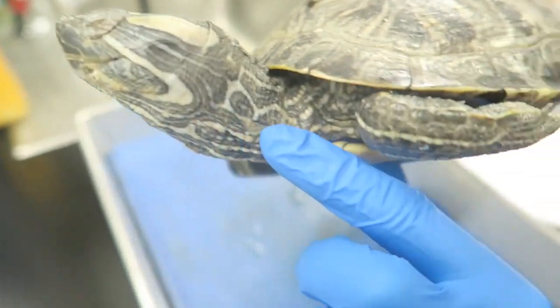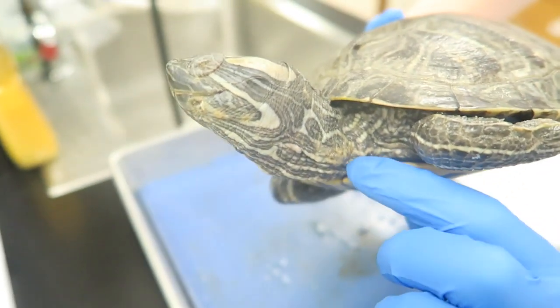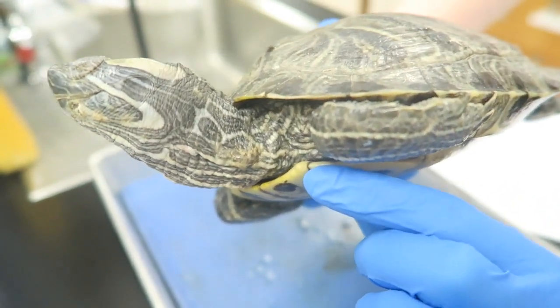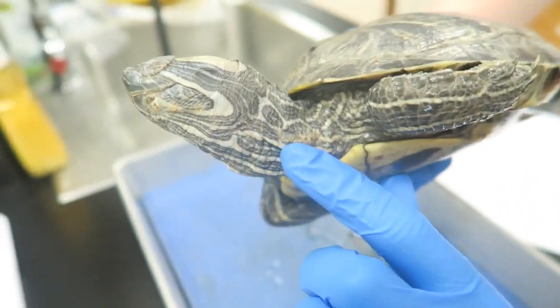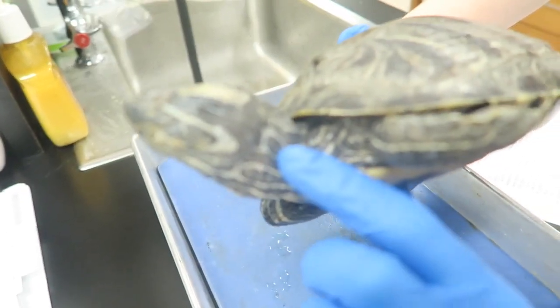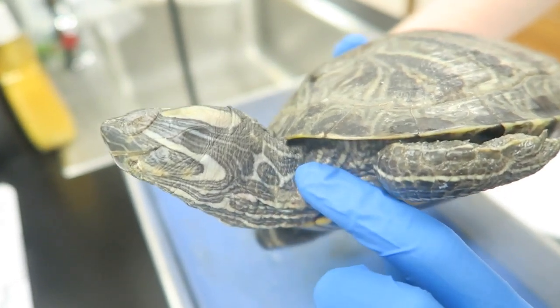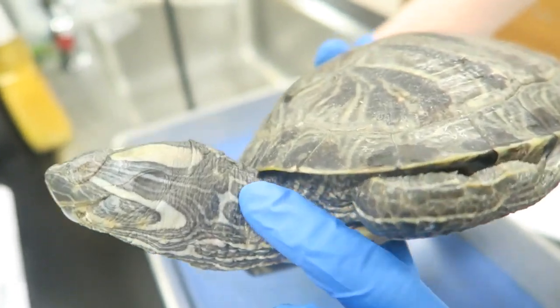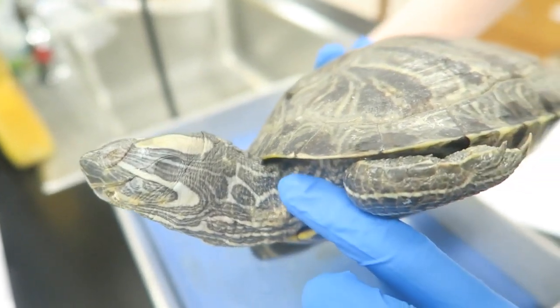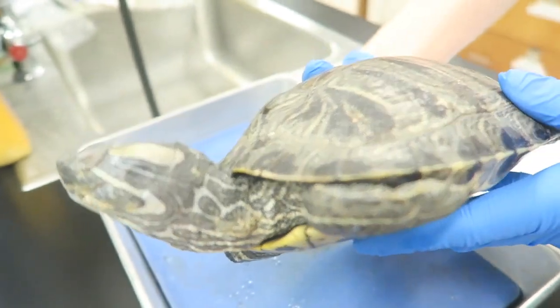Moving down you see the turtle's neck, which is shaped like an S in these painted turtles. This shape allows it to pull its head into its shell to escape predators. The neck is covered in scaly skin, which makes up the outer layer of the body wall and protects the organs inside. The skin is the main organ in the integumentary system — it's very tough, provides protection, and aids in osmoregulation because it keeps water inside of the body.